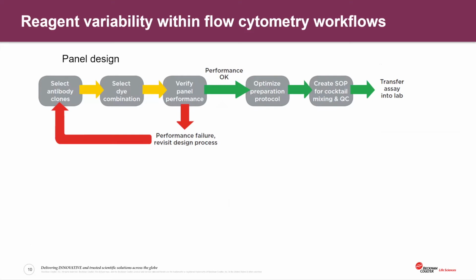So when you cocktail your antibodies, you can definitely have issues such as adding the wrong antibody, but not just that, adding too little of an antibody, or sometimes just overall forgetting it. But before we actually get to the cocktailing, we're just going to briefly touch upon the panel design.